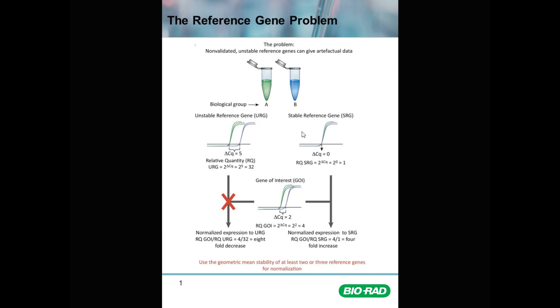Whereas if you're working with a stable reference gene, ideally the delta CQ between the control and treatment groups would be very low. In the best case scenario, presuming that the RNA samples have been assessed to be the same concentration and therefore the cDNA samples are the same concentration, a perfect reference gene would give a delta CQ of zero — literally no change between control and treated. Two to the power of zero is one, so the unstable reference gene gives a 32-fold difference while the stable reference gene gives a one-fold, essentially no difference.